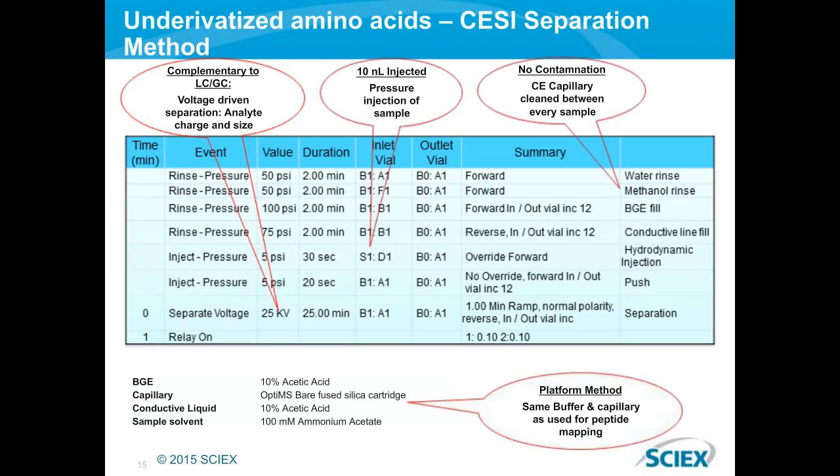I didn't use electrokinetic injection. I simply used pressure fill of the syringe over a certain period of time. And then you apply your separation voltage to separate your metabolites. In this case, what I also did was make up my samples in 100 millimolar ammonium acetate so I could do some on-column stacking using a technique called isotachophoresis. And this basically allowed me to inject more material onto the capillary to get a higher loading volume.